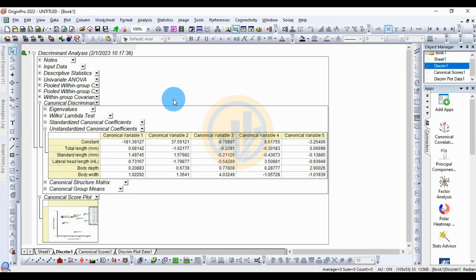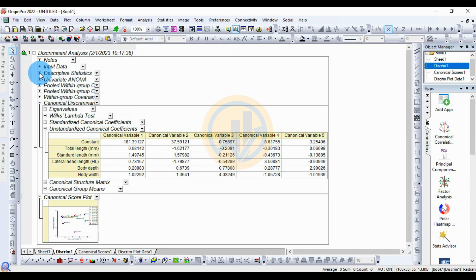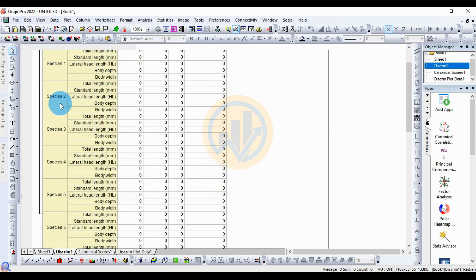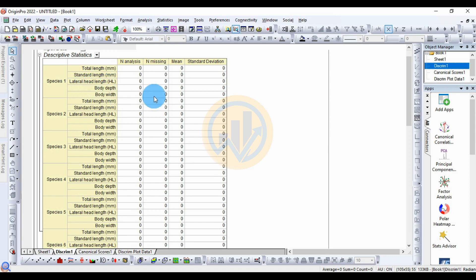This is the discriminant analysis output in OriginPro. The first section is the descriptive statistics. Click the plus symbol to expand the table showing discriminant descriptive statistics for the 10 species — covering total length, standard length, lateral head length, body depth, and body width.